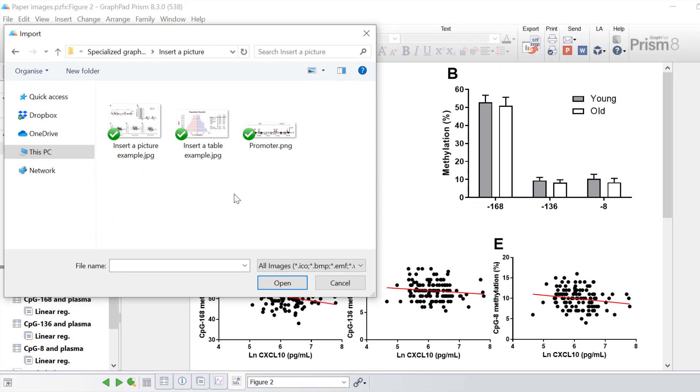You want to find the picture that you want to insert into Prism. Prism in Windows can import a range of image files. Common examples include TIFF, JPEG, PNG, GIF, PSD and PDF files.